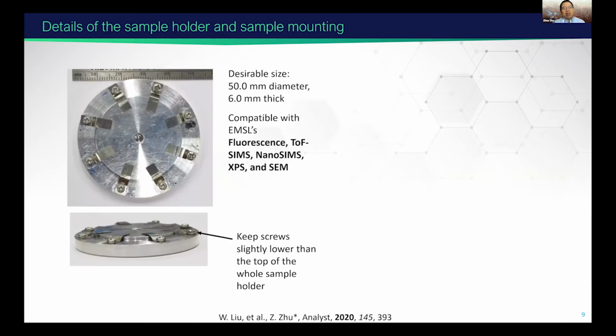Here are some details about the sample holder and the sample mounting. We designed this special sample holder. It looks not complex, but it still needed some thinking. First, it has a desirable size: 50 millimeter diameter and 6 millimeter thickness.